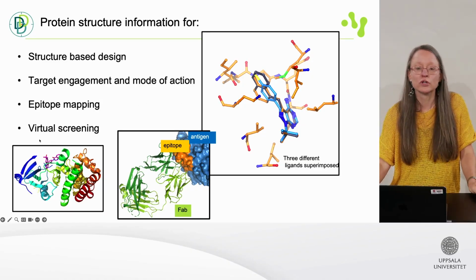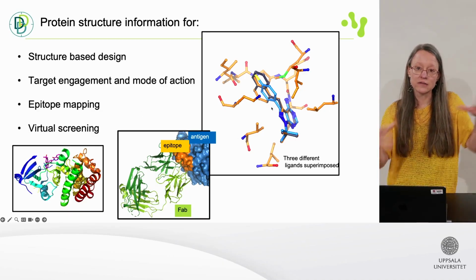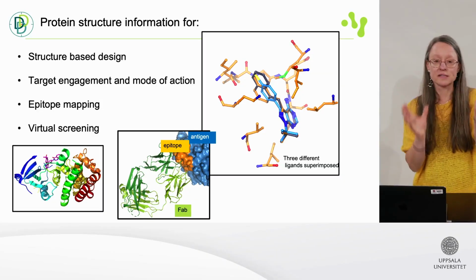We can also do virtual screening. Then we look at the binding site. We take away anything that is bound there, leave the amino acids, and see what other types of molecules could fit in the same pocket.